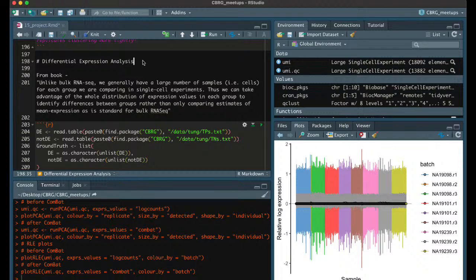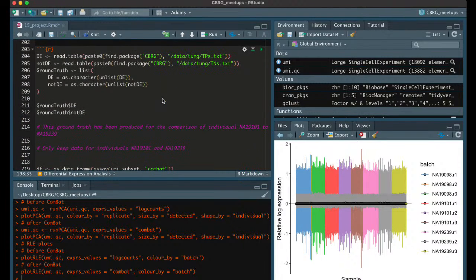Meaning, in this case, we're not going to do our standard kind of t-test comparing 2 means. We are going to actually compare the distribution for each gene of the expression values between 2 samples. And we will see how we can do that. And the test that we'll be running to evaluate this difference between distributions is called the Kolmogorov-Smirnov test. There are multiple approaches to quantifying the similarity between 2 distributions, and this is a very popular approach.